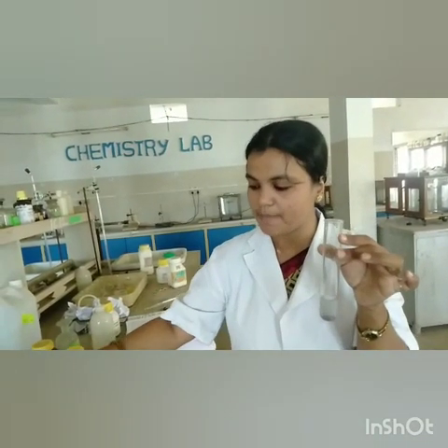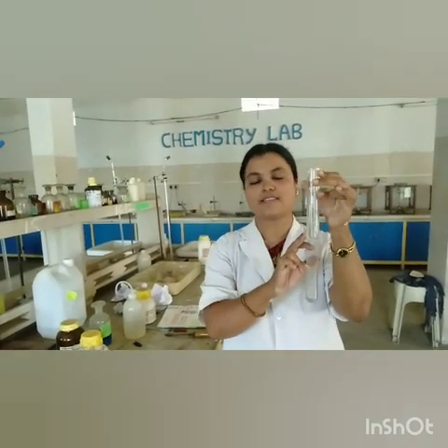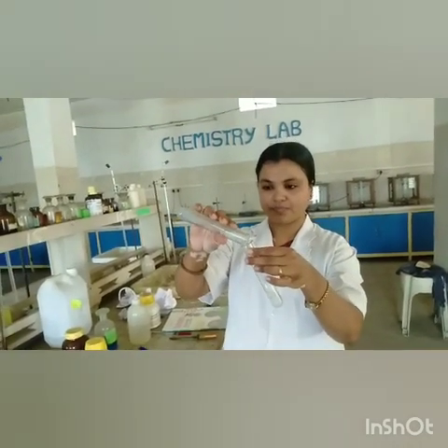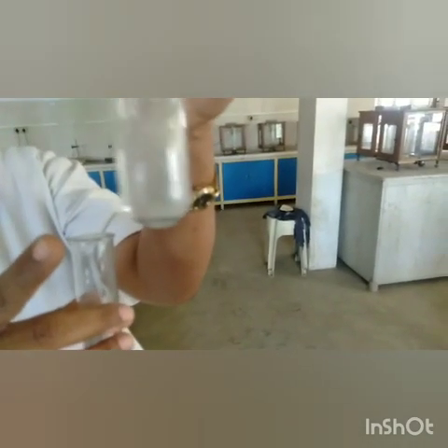Now let us see this same thing with zinc. Let us see what will happen when aluminium powder is made to react with zinc sulfate solution. Here is the zinc sulfate solution, and here is the aluminium powder. You will see that visibly no reaction will take place, but there will be a coating of zinc on the aluminium particles. You can see the aluminium particles clearly, and there is a coating of zinc. It shows that aluminium is more reactive than zinc.